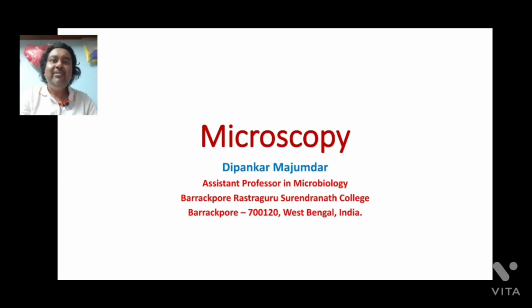Today we will discuss phase contrast microscopy. Phase contrast microscopy is a special type of compound light microscopy having some advantages. With the help of phase contrast microscopy, we are able to see living and unstained specimens.